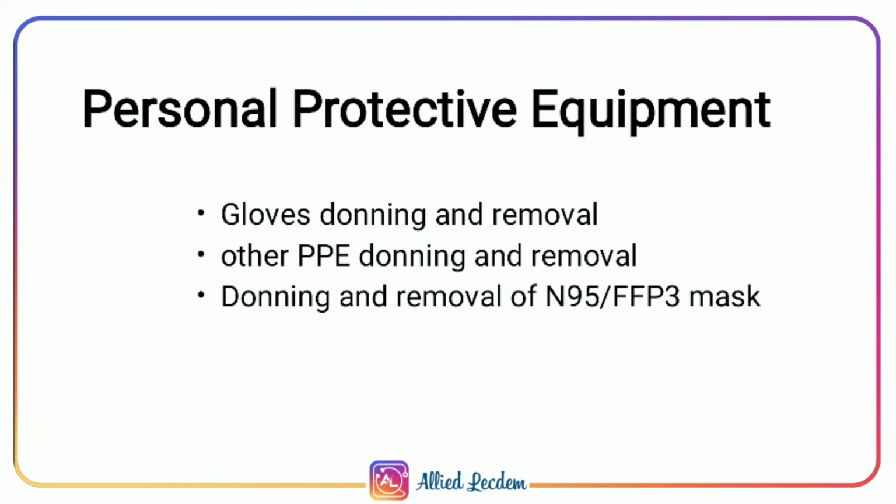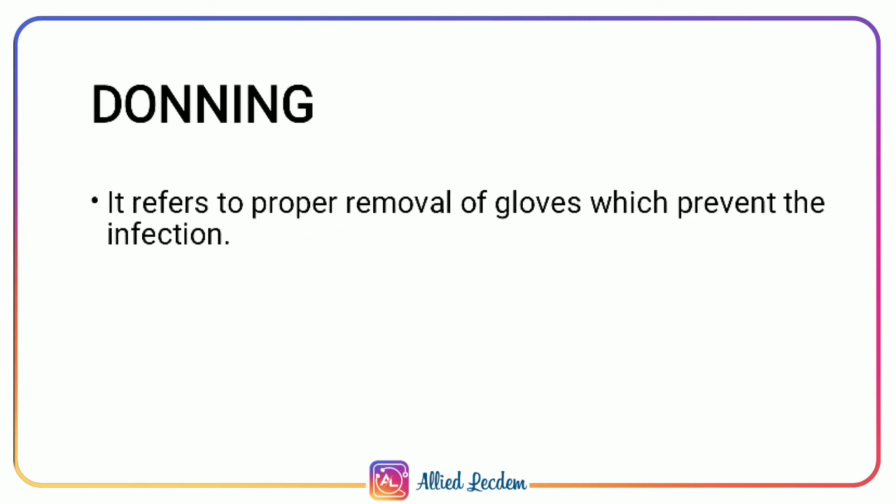Other personal protective equipment: donning and removal of N95 or FFP3 mask. Donning. What is donning? Donning means proper wearing and removal of gloves which prevents infections.